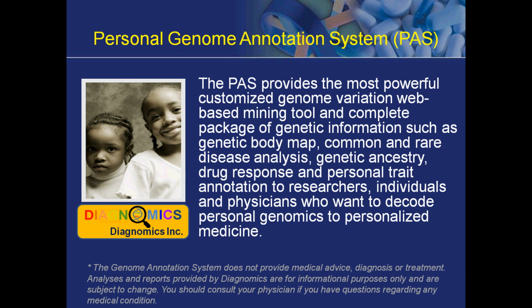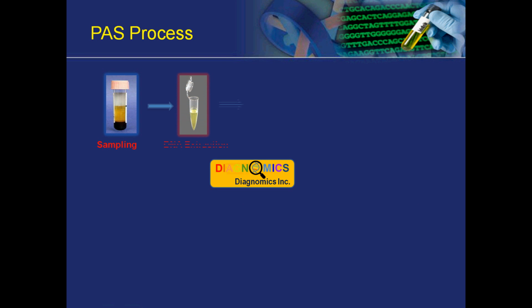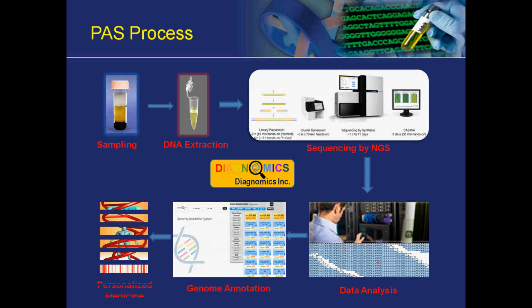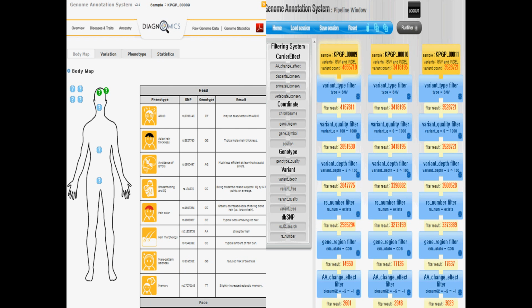This service starts with sequencing your genome, assembly and alignment, then lastly variant identification and annotation from next-generation sequencing. Our system takes advantage of research from various sources including public databases, literature, and other scientific work to analyze your genetic information. This system is constantly updated and is streamlined to offer summary-level statistics down to the variant level. Variant here is defined as any variation, whether it be a SNP, insertion, deletion, or copy number variation, or any other structural variation.